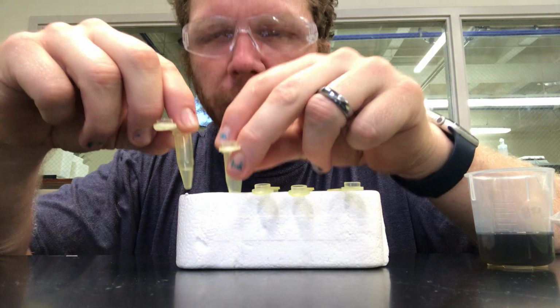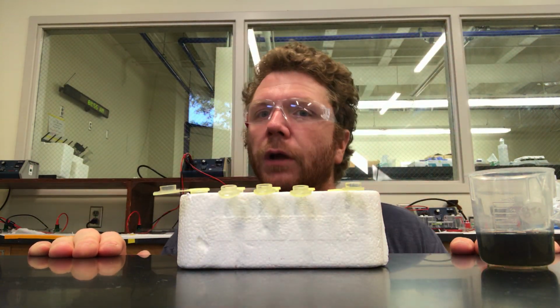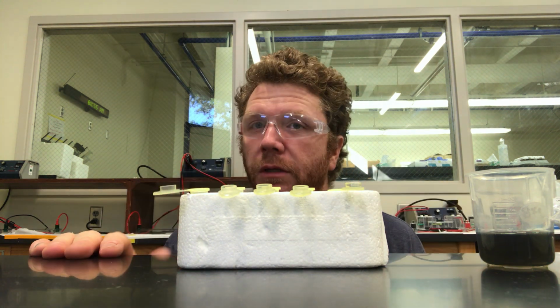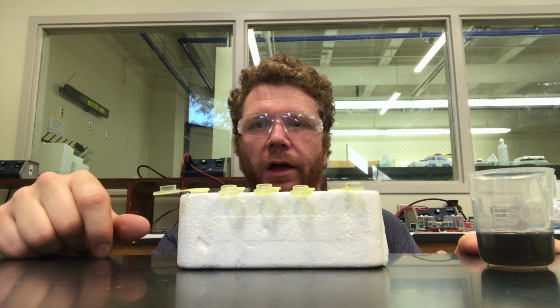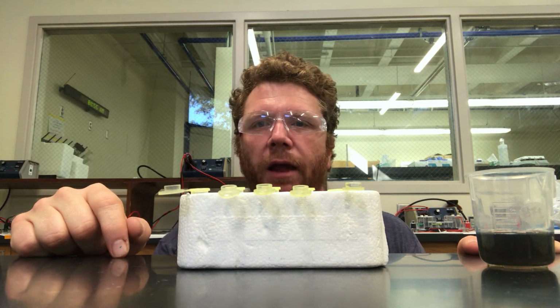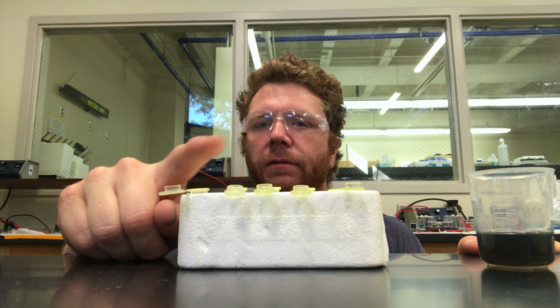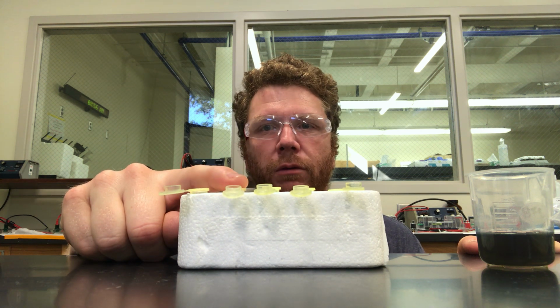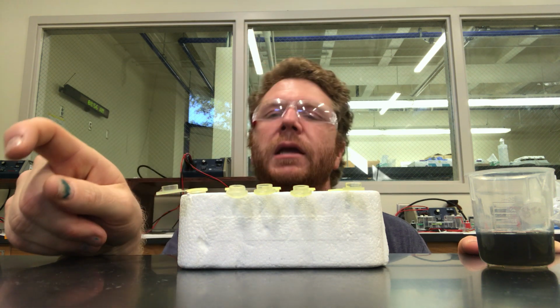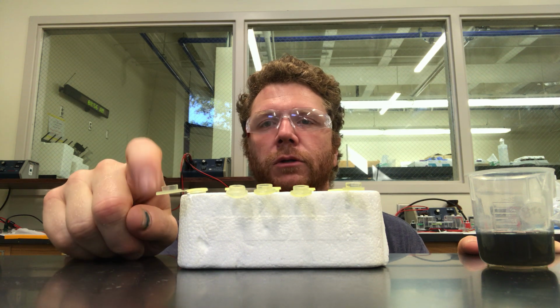Here's 4, here's 5. Now the reason that 5 has a greater volume is because I transferred 100 additional microliters from the deionized water into tube number 5. And I did that because I wanted to dilute sample number 5. Whenever I took 100 microliters from 4 and put it into 5, the concentration was the exact same. It only changed when I added my last 100 microliters of deionized water to tube number 5.